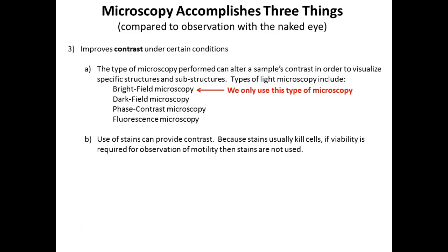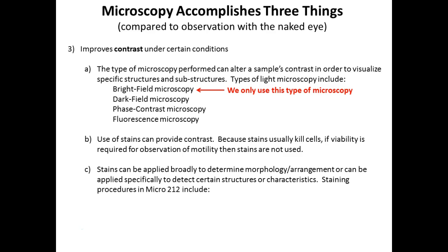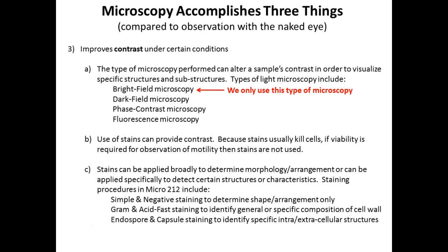So stains help provide contrast, right? The problem is it will kill them, right? So when it comes to motility, we can't stain them. Stains can be applied broadly to determine, and that's what we're going to do today, just shape and arrangement, right? You'll see the individual cell shape, and if they stay together in groupings, what we call arrangements. Or they can be used to look for specific structures or characteristics. So the types of stains that we'll do are simple and negative staining today, which is, again, just morphology, just shape and arrangement, is all you're going to be able to tell about those organisms.